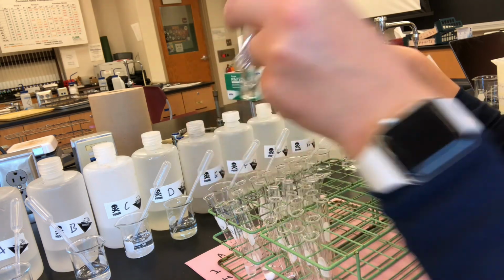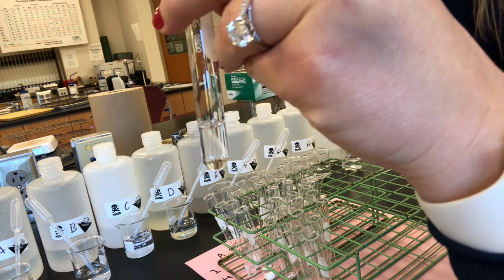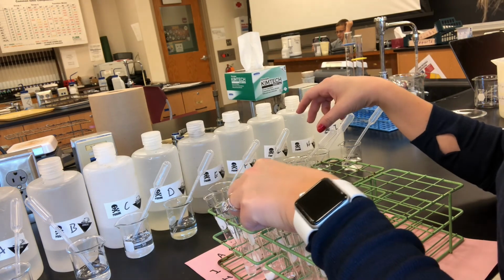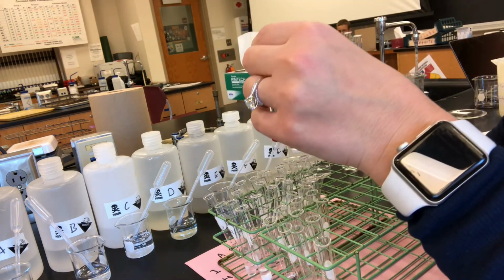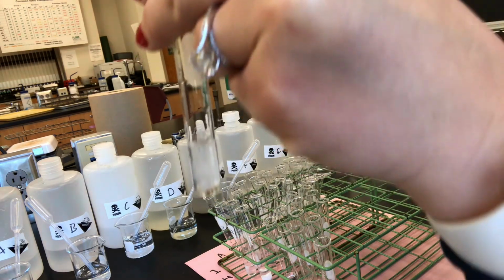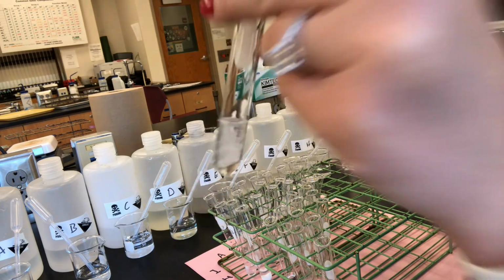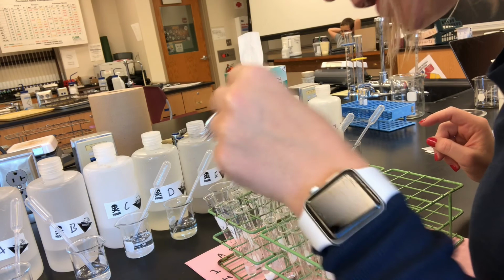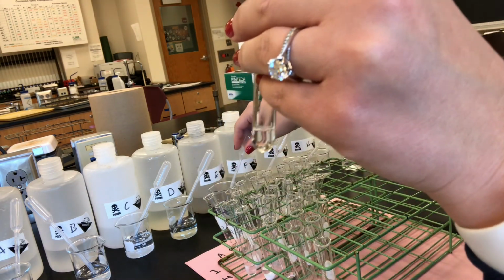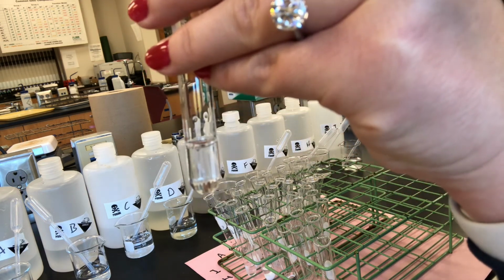All right, B and G. Nada. No change. All right, so B and F. B and F. Precipitate. You see it? Definitely got a change there. That was B and F. All right, now so we're on B and E. B and E. No change.